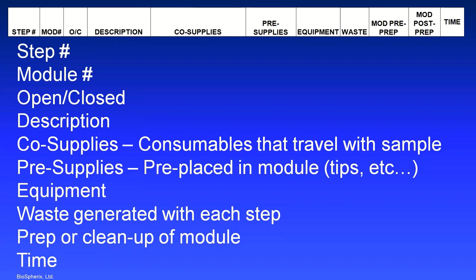And then you have equipment, that's self-explanatory, any waste that's generated in that step. And waste is important to plan for in your Xvivo, which you may not be used to if you're only used to working in a biological safety cabinet.